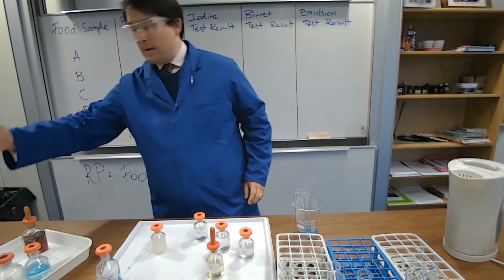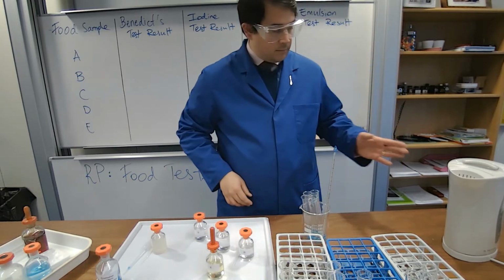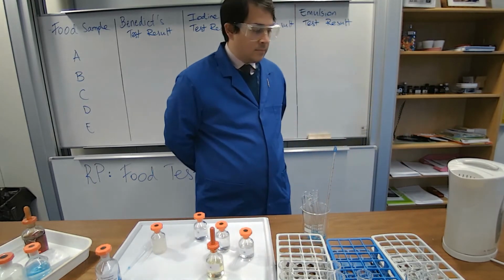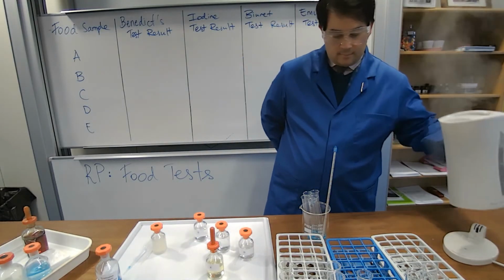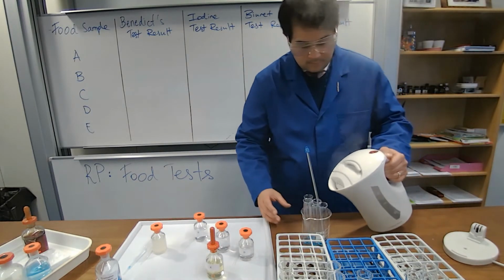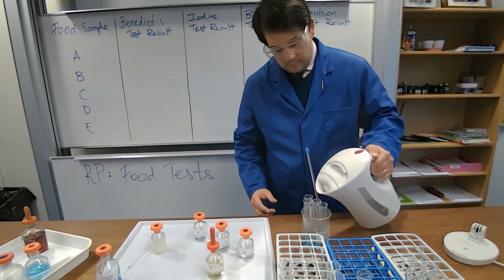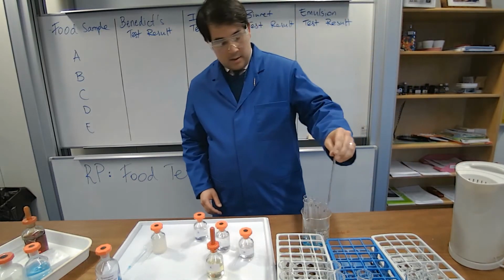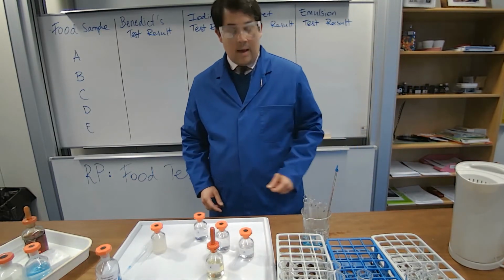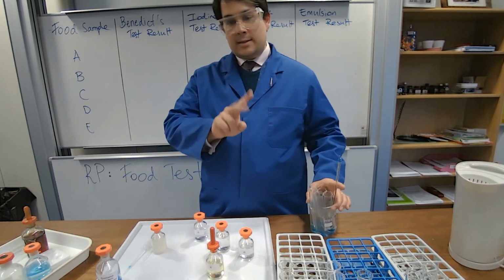Trust the thermometer to make sure it's over 80 degrees. Yeah, over 80 degrees is good. We should then have a positive result in about 2 minutes time.